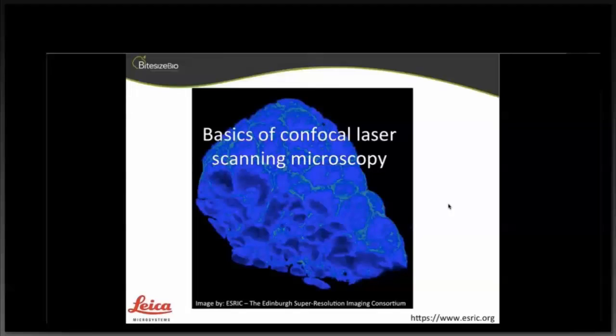Okay, how can you improve the resolution in a Z stack? You can increase it by having more pixels, bearing in mind that it will take a lot longer. When you take a Z stack, it is very, very important that you sample correctly, and you can find out how to do that using the SVI website, which has something called a Nyquist calculator. That can give you an idea of the sample step size and the lateral pixel size that you need to use to get the best sampling rate. If you do this, you can again use deconvolution, and that can help with the Z resolution.